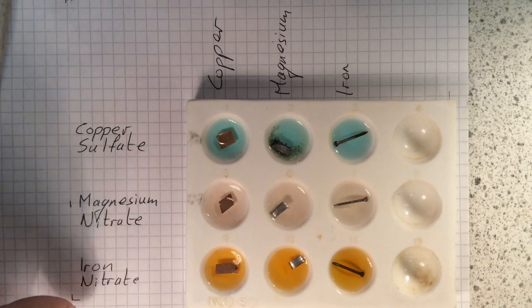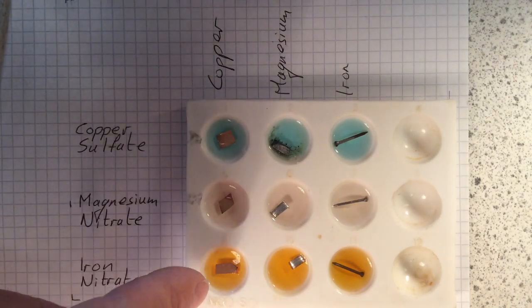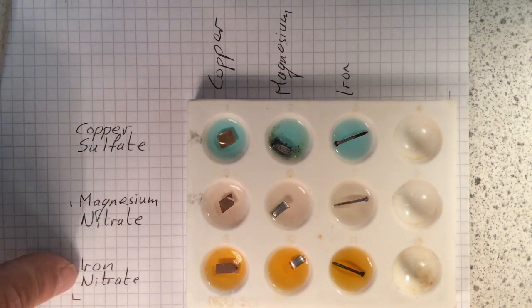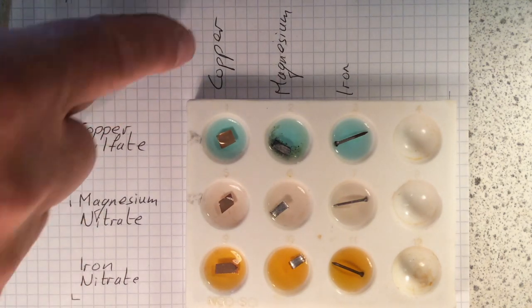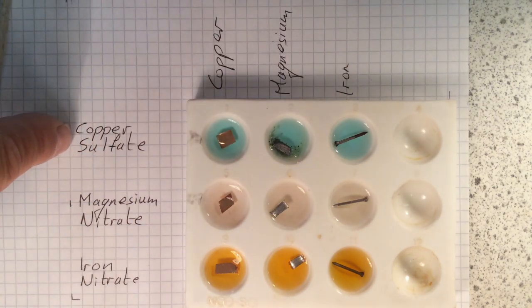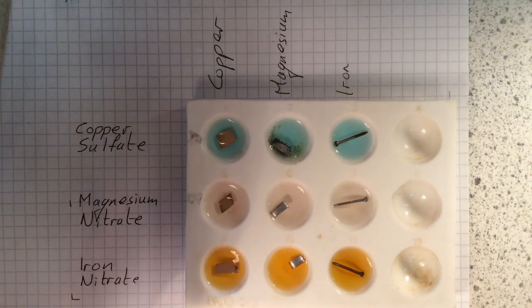Then we look at iron nitrate. Iron nitrate and copper, there's nothing going on here because the copper is unable to steal the nitrate from the iron because the iron is more reactive than the copper. And we found that before because this iron here stole the sulfate from the copper sulfate here.